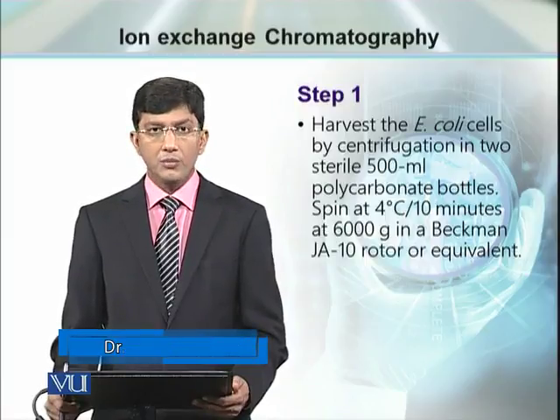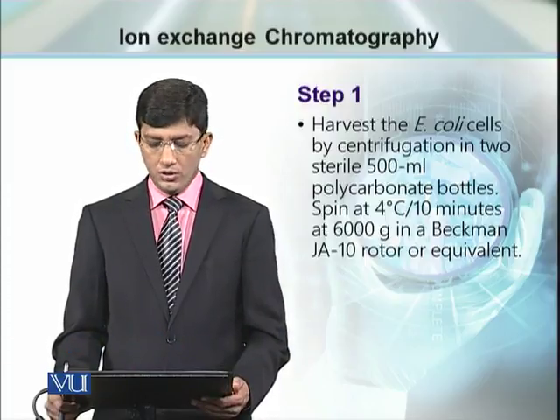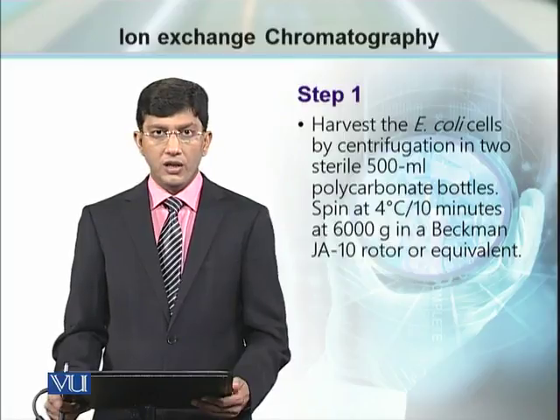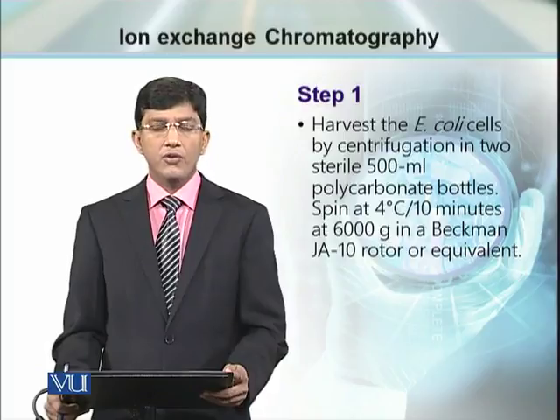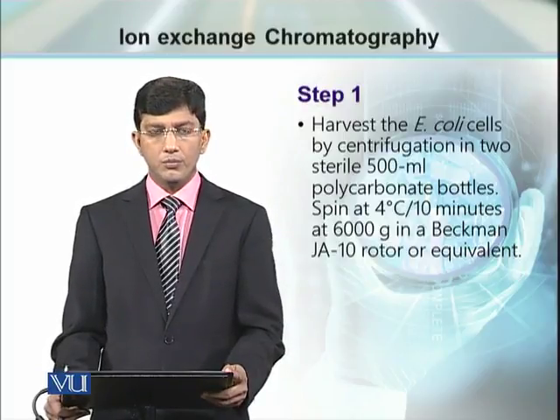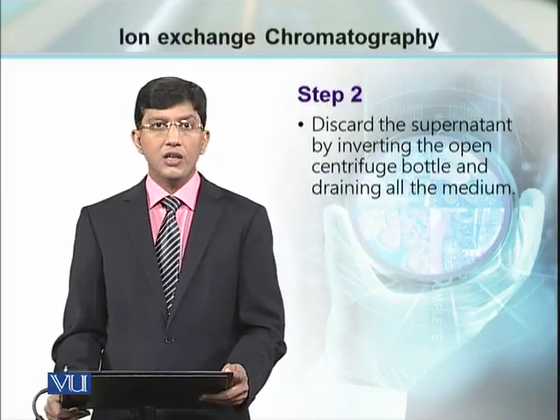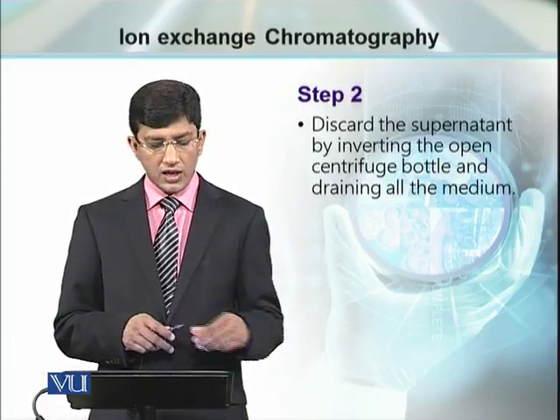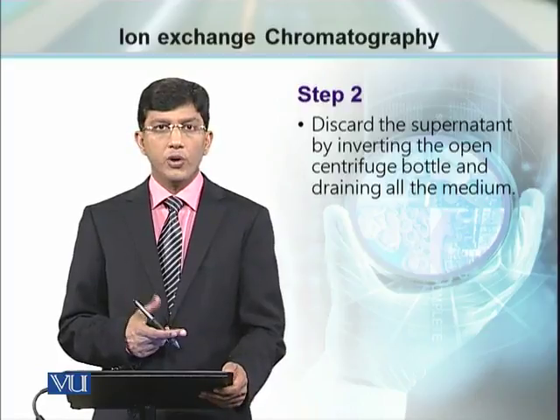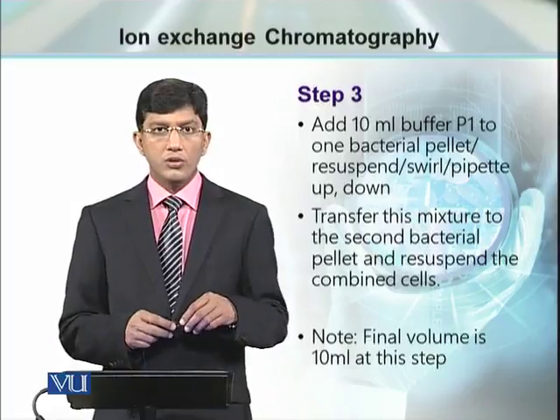For harvesting the bacterial samples, we have to spin the tubes at 4 degrees centigrade for 10 minutes at 6000 G. This step is going to settle all the bacterial cells in the form of a pellet at the bottom of the tube. The supernatant is no more required. It can be discarded.